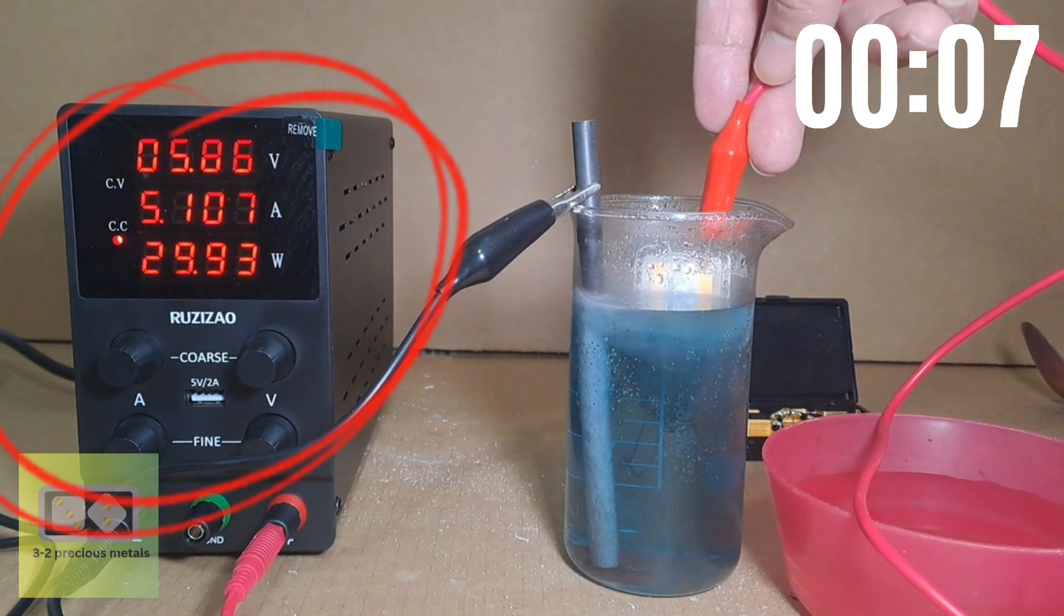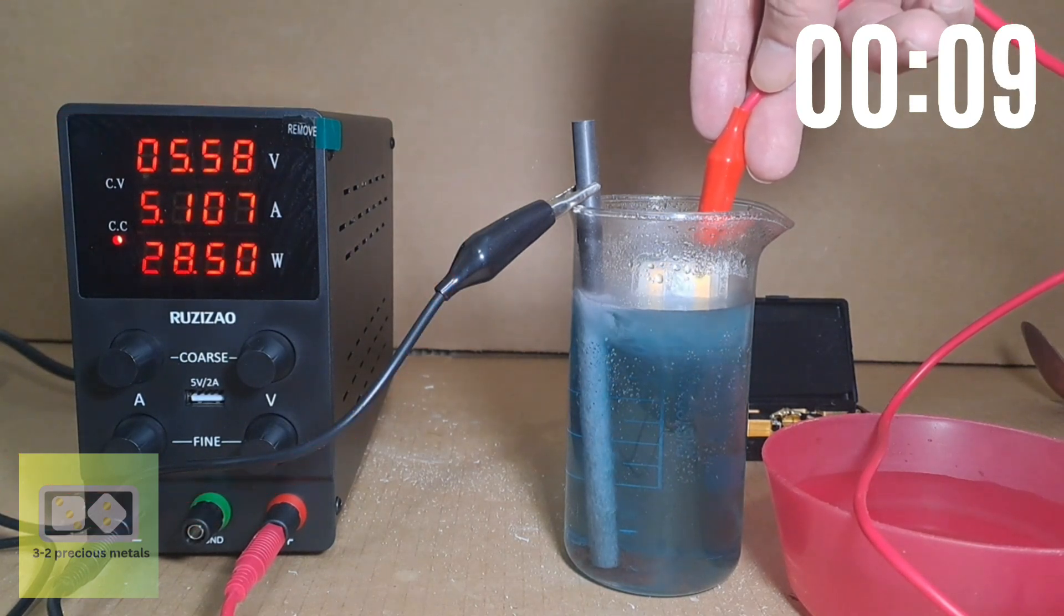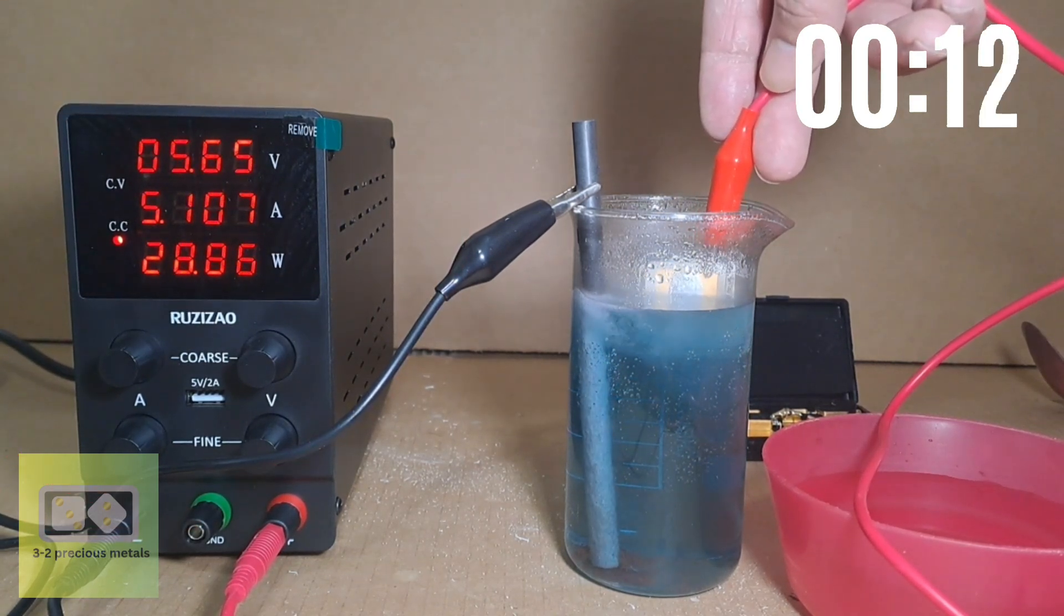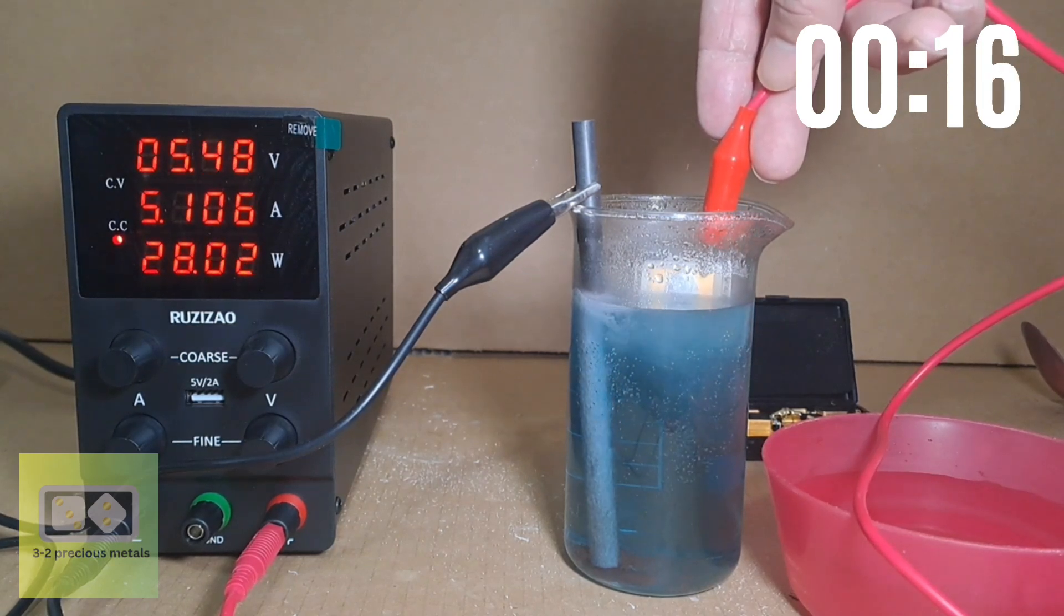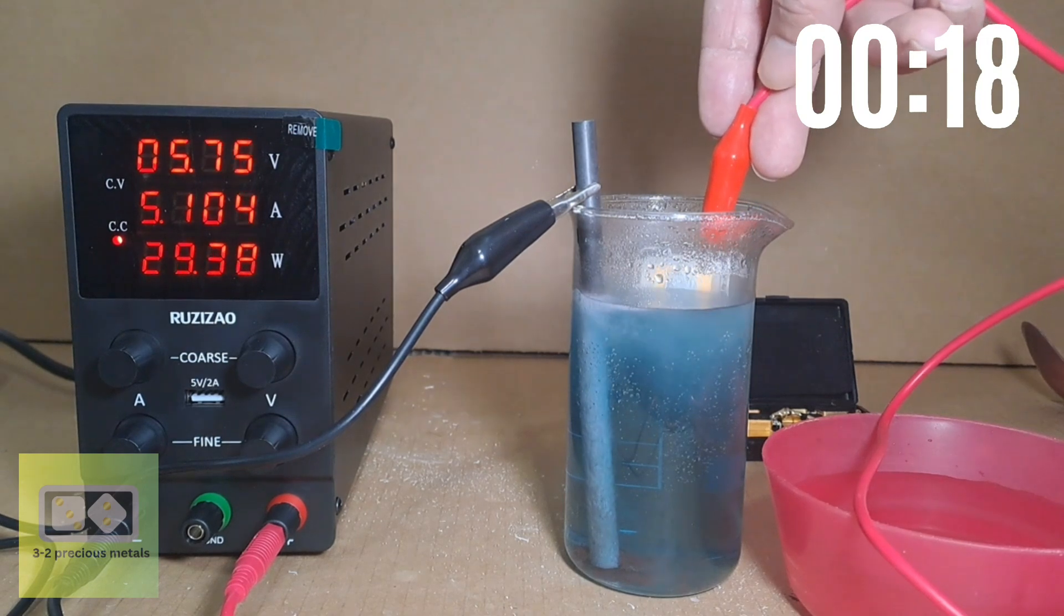On the left we have a DC power supply. It's a regular power supply with adjustable voltage and amperage. For this experiment I have it set at just over 10 volts and 5 amps.